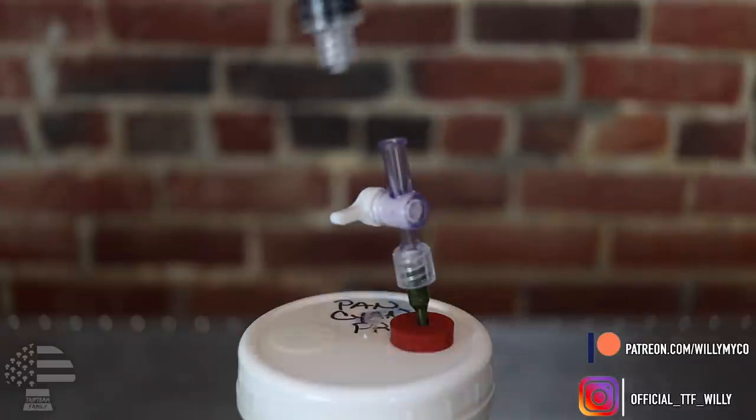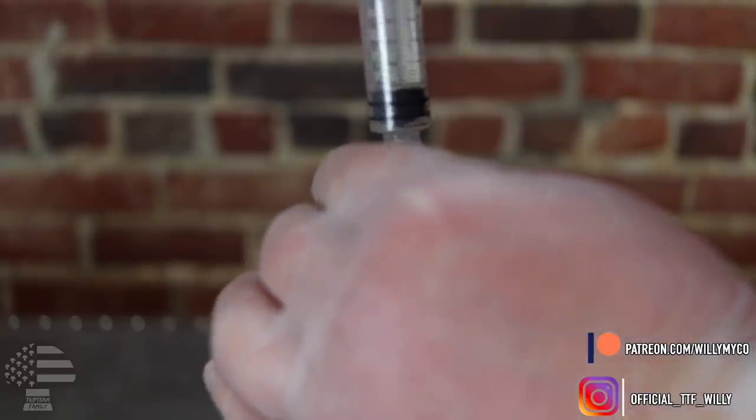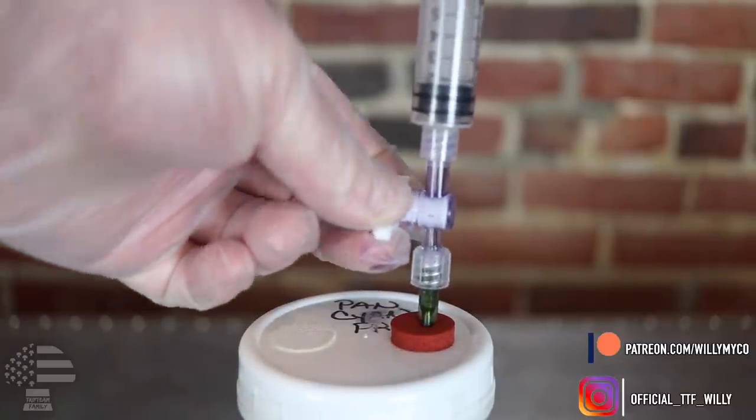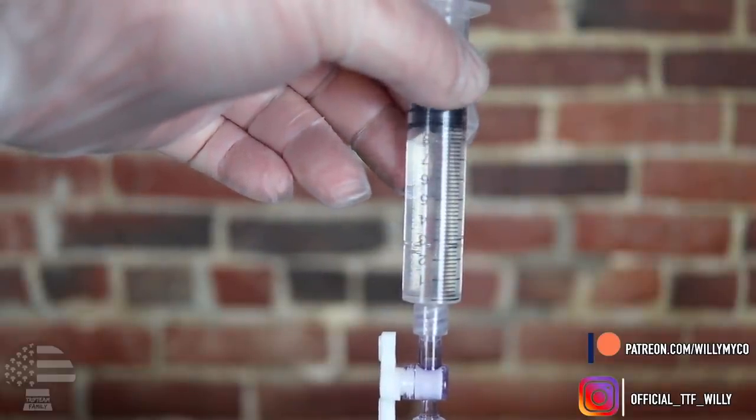To use it: shake it up to get all that mycelium broken up and floating around. Then take a brand new syringe, attach it to the top of your stopcock, open up the valve, suck up some of that LC, close the valve, and take off your syringe — it's ready to use. Typically I'll take another syringe and just leave it attached to the top of the stopcock so nothing — no dust or anything — can get inside. When you need more LC, there's already a syringe there protecting it at the same time.